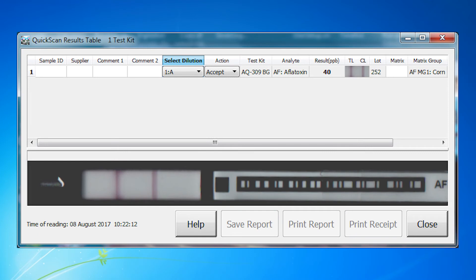Step 6. On the quick scan results screen, choose 1A under the dilution tab drop-down menu. The system will calculate and record the aflatoxin level in the diluted sample. Adjusted results are valid in the range of 30 to 100 parts per billion.